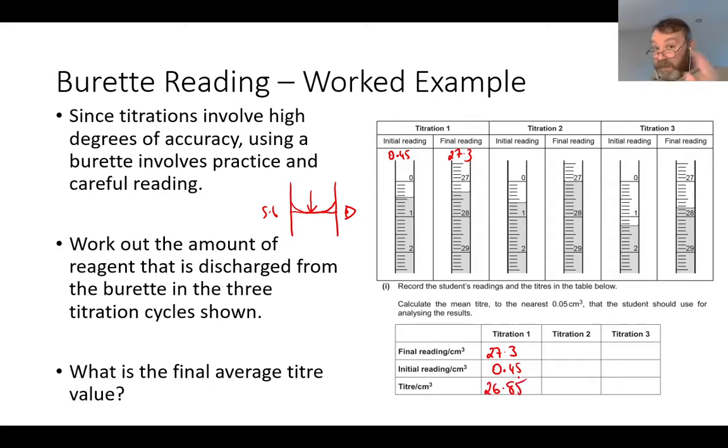Okay, now that's my guide. We won't ever be using that in the calculations, but it's a guide. So I move to titration 2 and I run it again, this time being very, very careful to try and mark the point of neutralization, the end point of the reaction. And here's the readings I get.